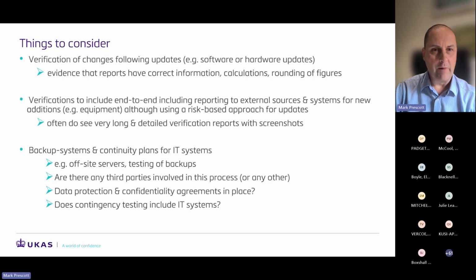And so I will look at the verification reports, and we can only really make an informed opinion as to whether it's been done correctly by looking at things like screenshots, just getting the general impression that the IT department or the laboratory have covered all angles. I'm talking about doing the full end-to-end testing, but having screenshots of every single stage from when it was requested to when it was reported will show that you've actually done this properly and that the full pathway is working. So do bear that in mind. If these verification reports are very large and very long, it doesn't matter, as long as they're available to the assessors to have a look at.